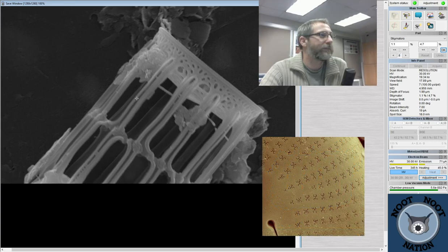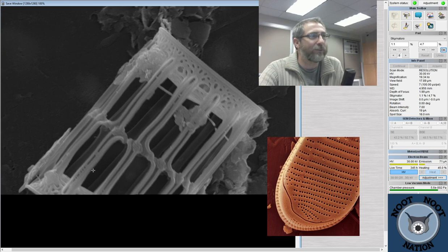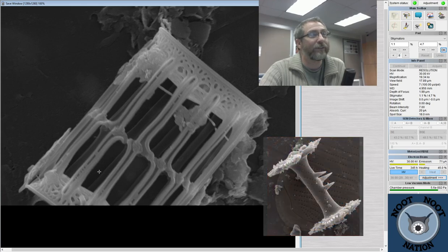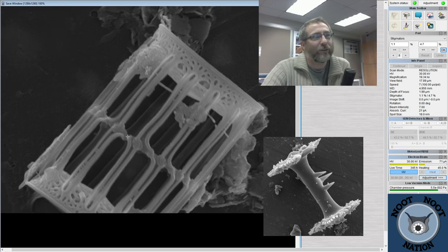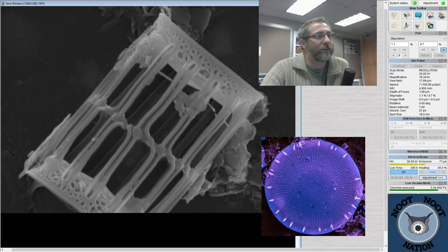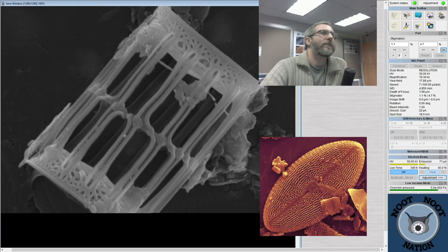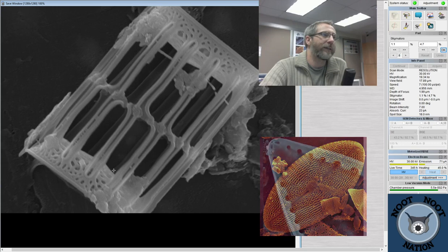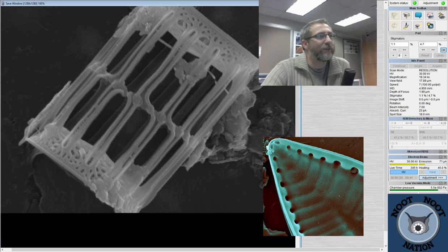Could be better. I need to find something that's very flat and has a lot of little holes that I can get the stigmation perfect on. So maybe I'll try to do that briefly next. When I'm struggling to get the stigmation perfect, in part it might be because the filament's getting a little old, but part of it might also just be that what I was trying to focus on to get the stigmation correct wasn't exactly perfect for it. So maybe we'll see more, but you can actually see some of that really intricate, ornate valve face right here. This one's got a little bit of clay in a couple of places, which detracts from my image as well.